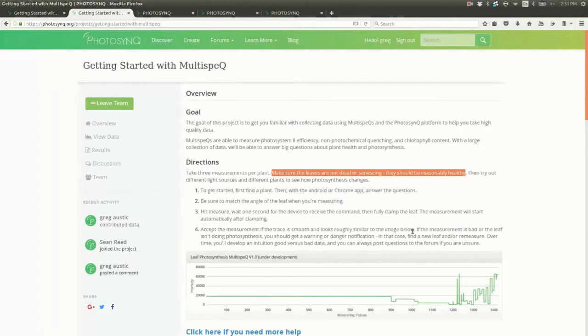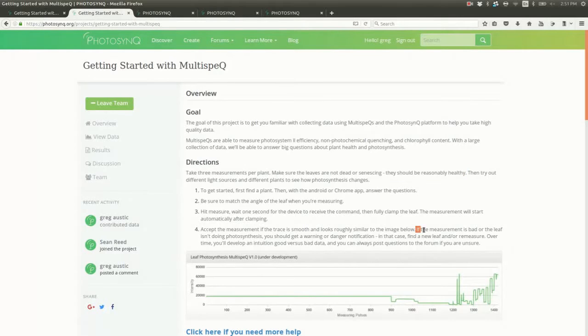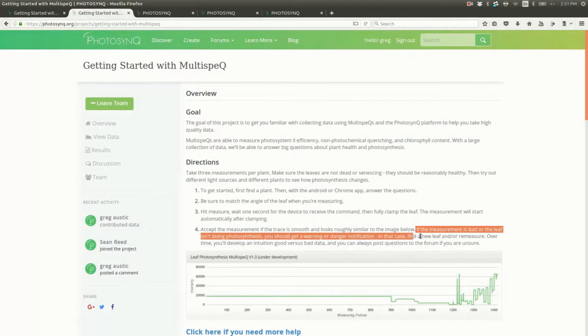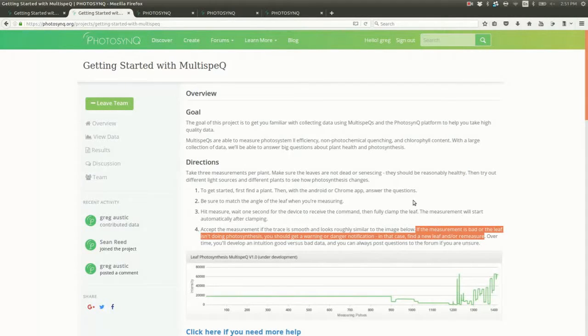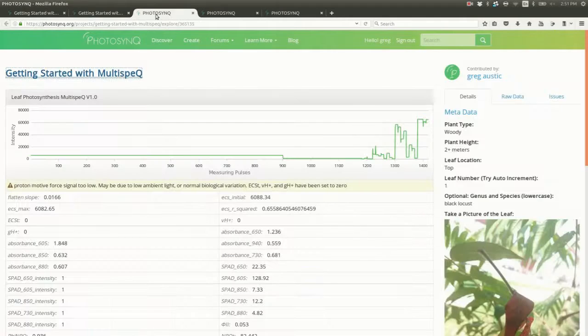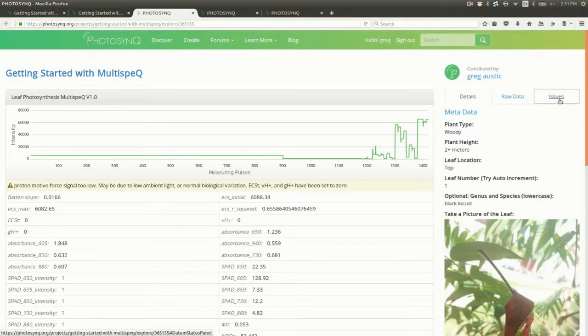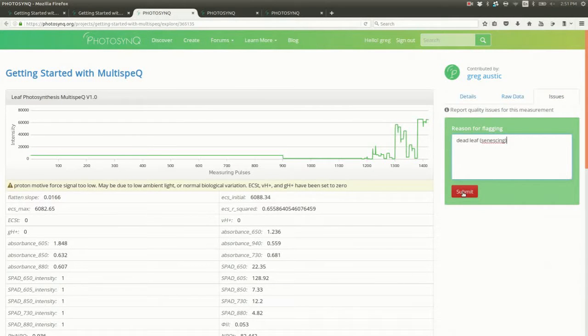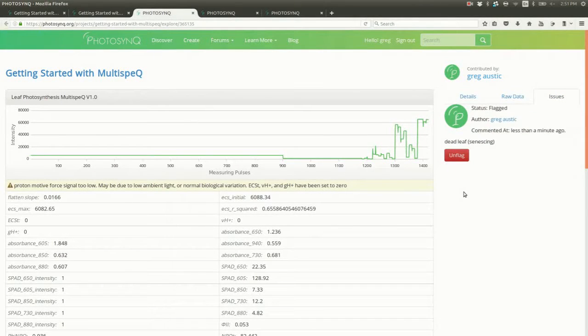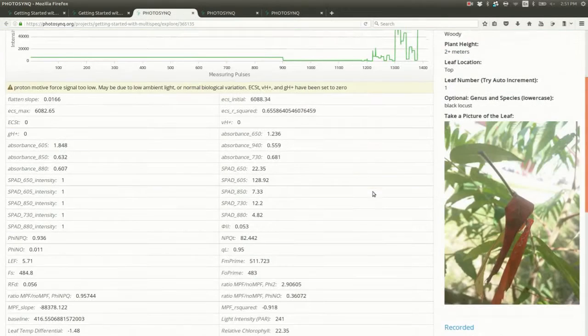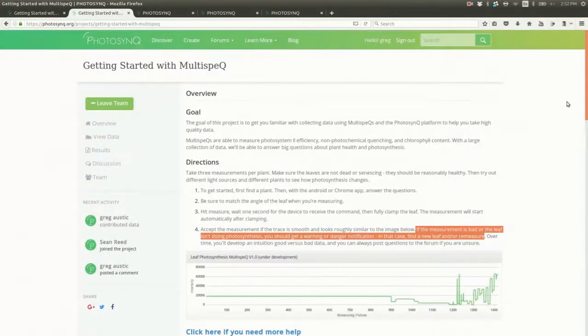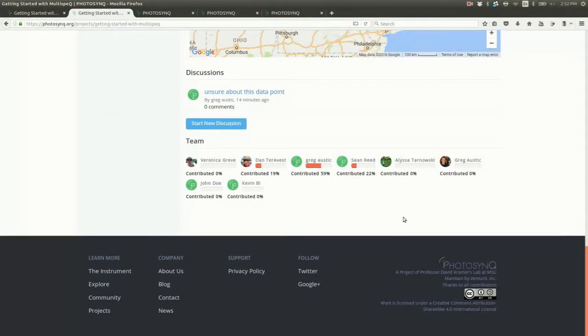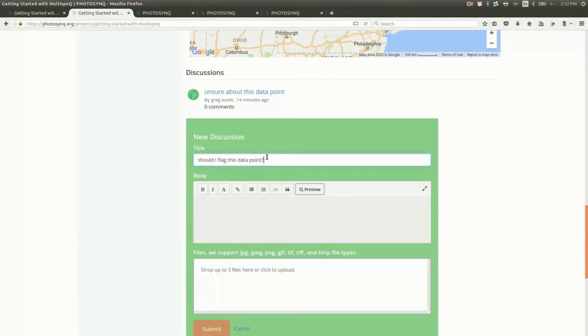Be careful when flagging to always have a good reason. An outlier could be the most interesting data point in your whole project, so only flag data if you're confident that there was an actual error during the data collection. As always, if you're unsure, post your concerns to the project forum.